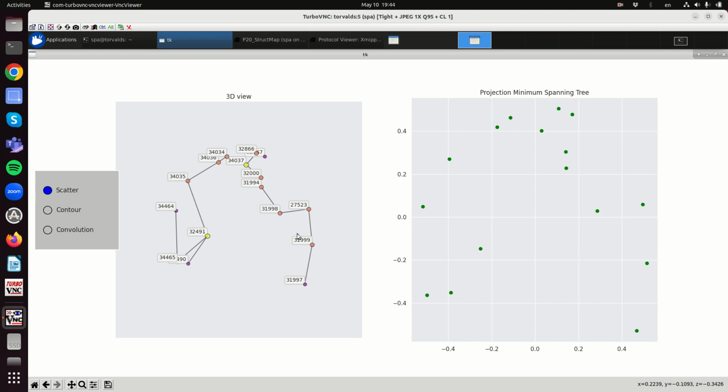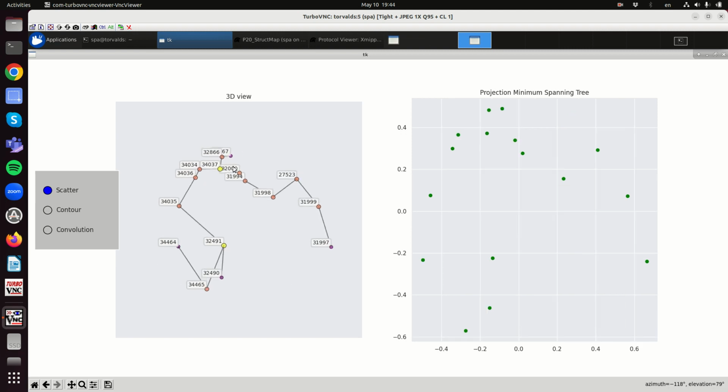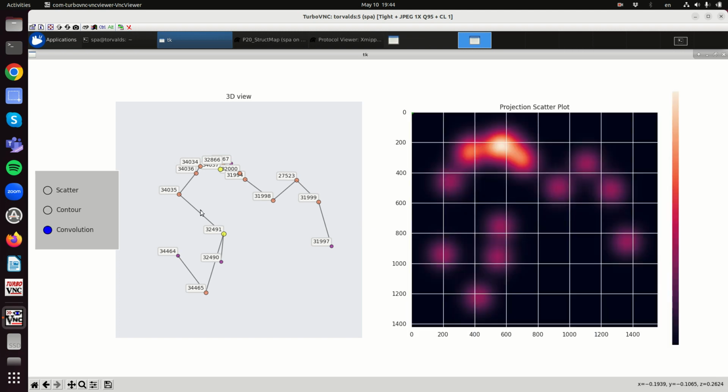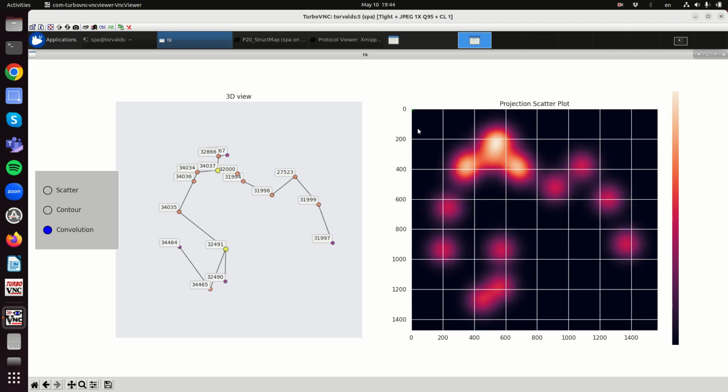And this is a 3D trajectory, and this is the projection in 2D of that trajectory. We can see, for instance, convolve like this, so that we can see whether they are clustering in some region. So all these maps here are kind of similar, and we can now inspect the structure and put some order in. For instance, if we are doing a morphing, we can do the morphing following this order, so that we can try to understand what is the trajectory followed by the particles.